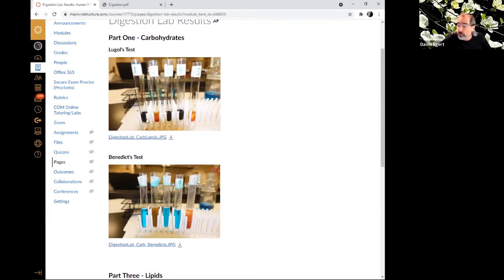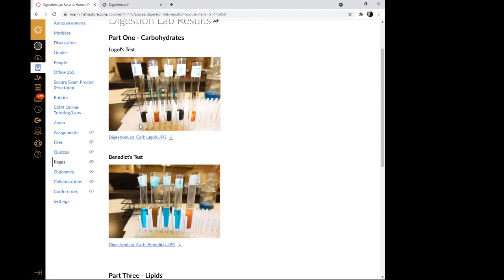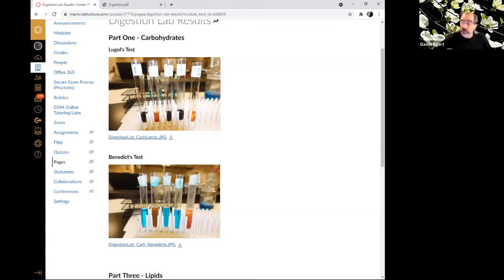Does it look like the starch broke down at all at body temperature? No. No, it looks like starch is pretty darn stable because the starch positive for Lugol's is still full of starch, and there is no maltose, so none of the starch broke down. Right, so this is telling us if you just look at starch, it doesn't just actually break down in front of your eyes without any help. Tube 2, does it look like there's any starch breakdown?